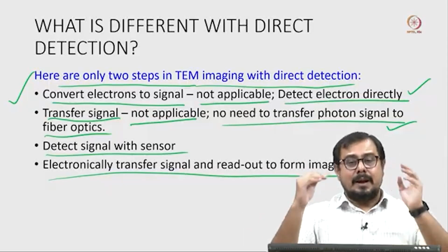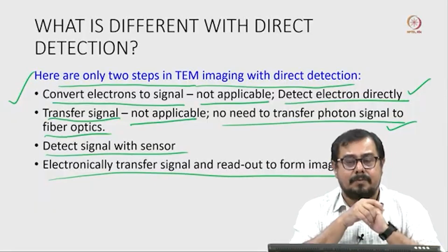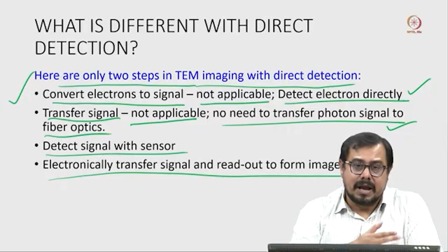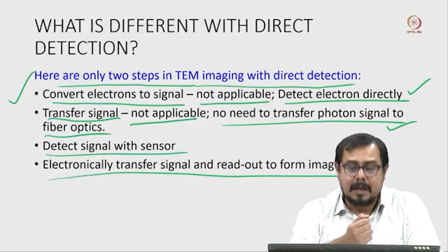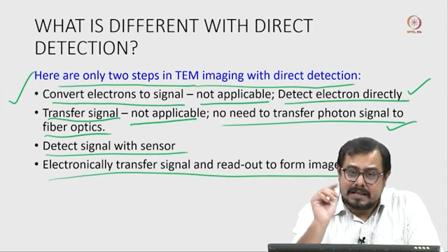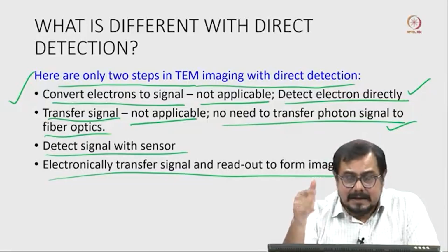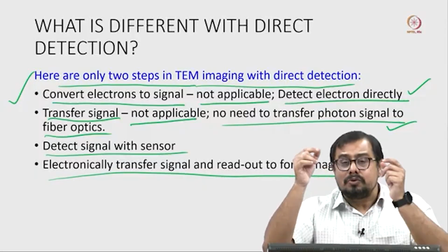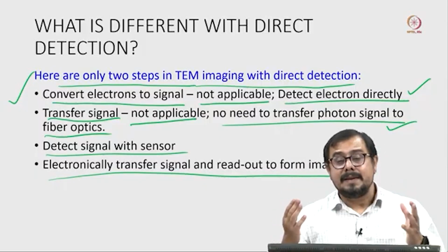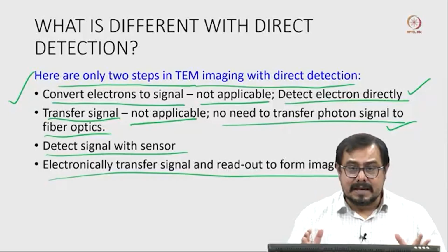Here what we have to understand is why we are suddenly interested in recording the high frequency signal. These high frequency signals are very important when we are trying to collect high resolution data. High resolution data means when we want to see a protein structure, the helix of a protein, or DNA helix, or RNA secondary structure, tertiary structure. We want to see the beta strand, we want to see the side chains of the amino acids. That means we have to see the tyrosine, tryptophan, lysine, glutamic acid side chains.